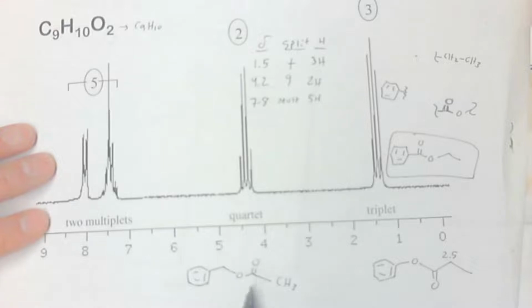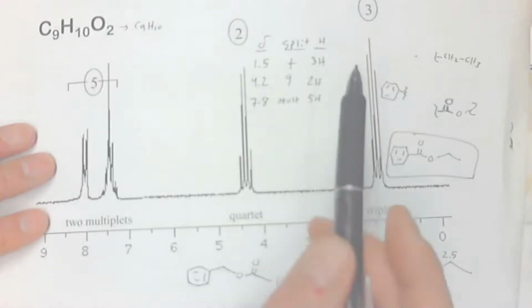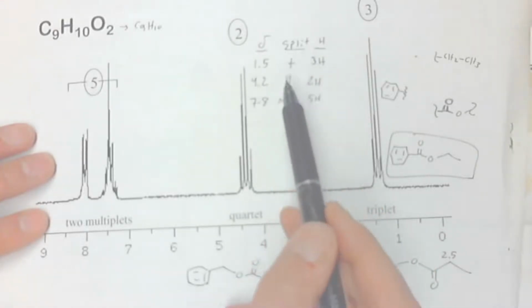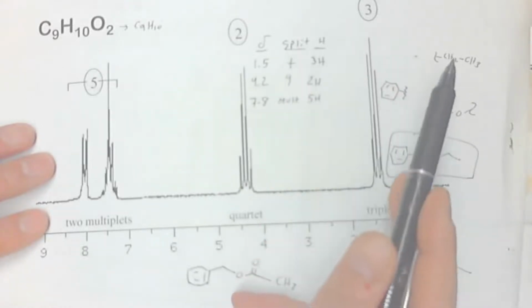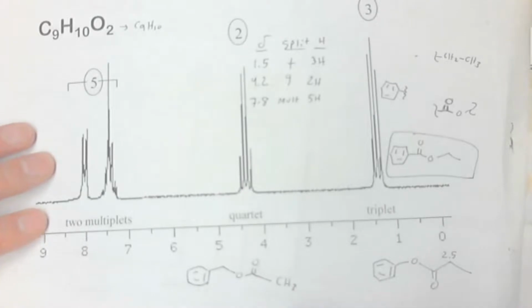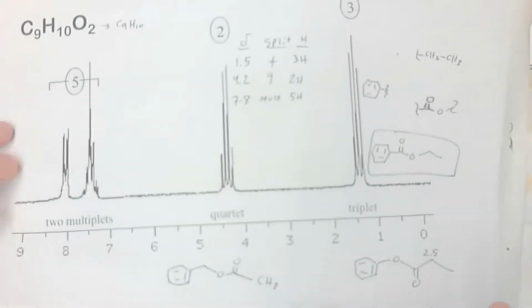So yeah, kind of cool, huh? That's why I love to use the splitting really early on, to use up the splitting information to figure out what your multiplets are, right? We cool? All right, let's keep going.